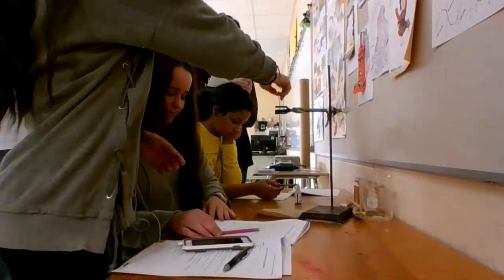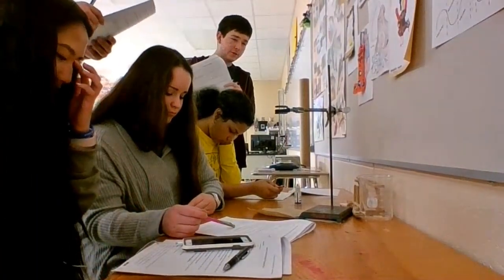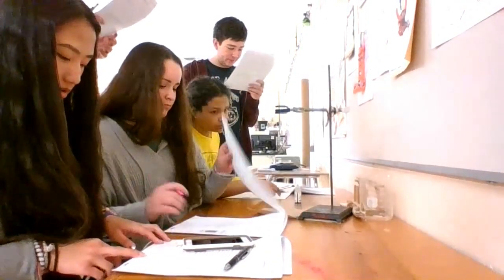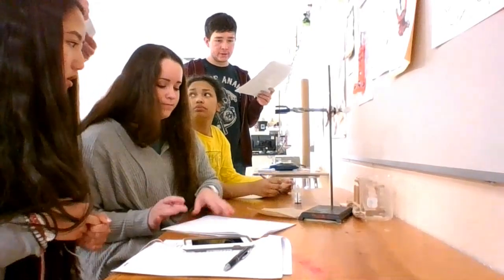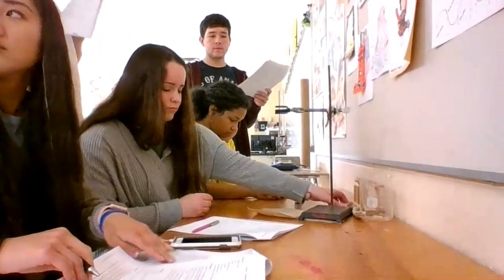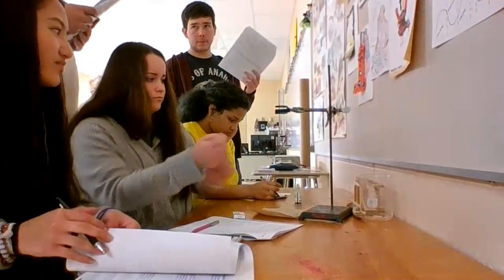So this is the monster. And it's okay if it drips out a little bit. Invert this. How do we determine that? All right, so it's blue right now, which indicates base. Now strike a match and hold it so the smoke goes up into the test tube.